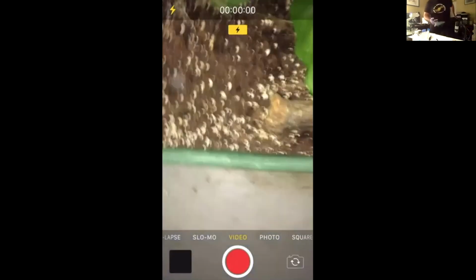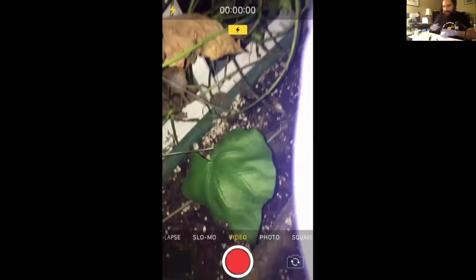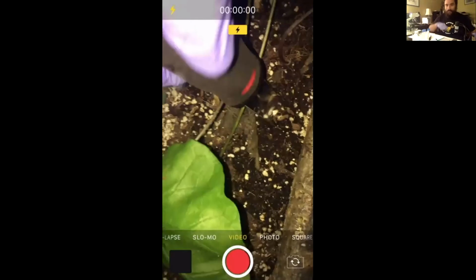Oh, you guys are still watching me do the collection. This will be fun. I'll wait till it catches up. It's kind of like time travel. I think it's fantastic, really. It's cool. It lets me prep the sample on the dissection scope, which is perfect. I really hoped Zoom wouldn't crash, and when I tested it out, it was fine.